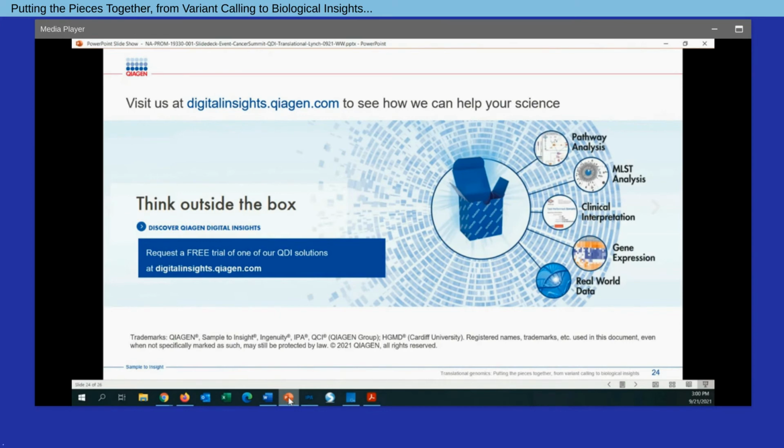Yeah. I think the best way to think of that is that your CLC Genomics Workbench is for your secondary analysis, which gets you to that differential expression, and then IPA takes it over to take that differential expression, and we'll just use that term broadly. It could be protein expression, obviously mRNA expression, microRNA, et cetera, and then analyze it there in IPA.